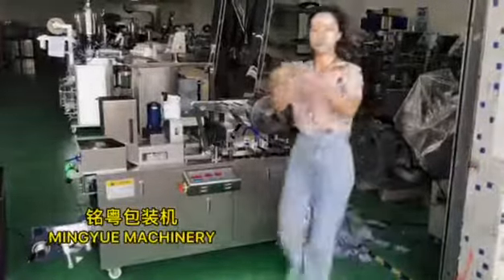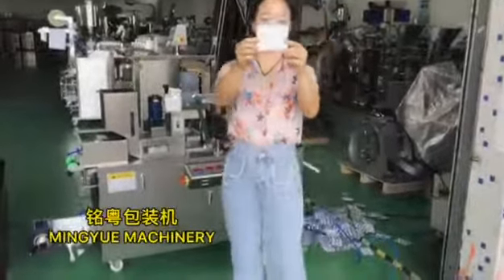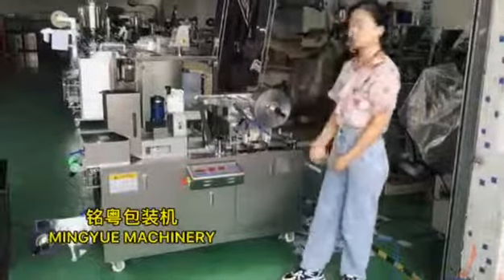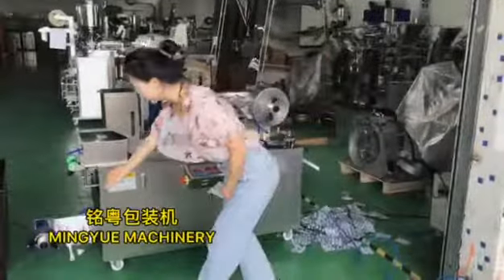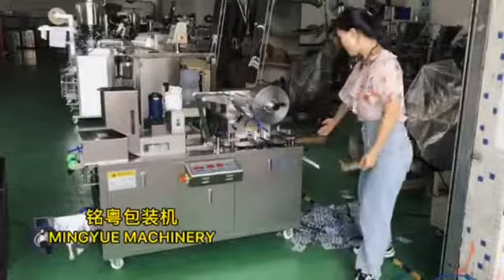When the machine can make one plate sample, a very nice sample, we can start full packing. Then you can see from the PVC form, the aluminum foil, and the cutter.